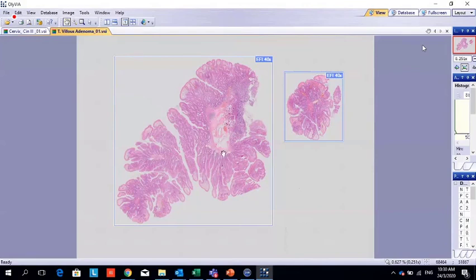Okay, what do you see? What do you think all these are composed of? What are these? Columnar epithelium. Yeah. So all the structure is glands, isn't it? So we call this a polypoid structure, composed mainly of glands.